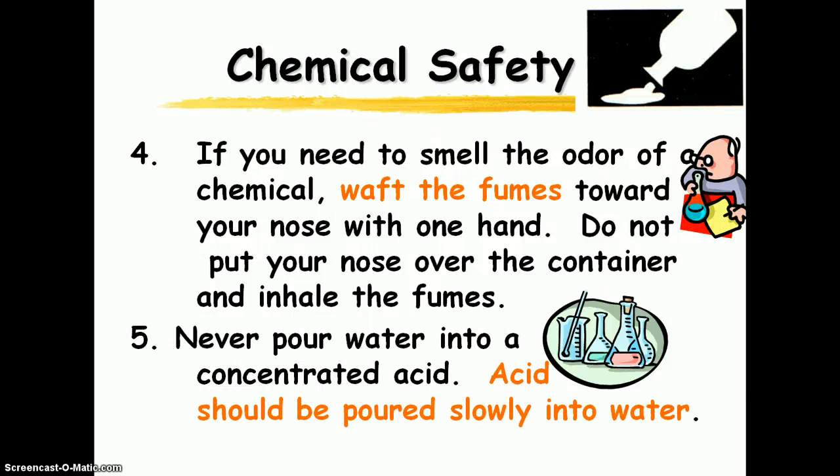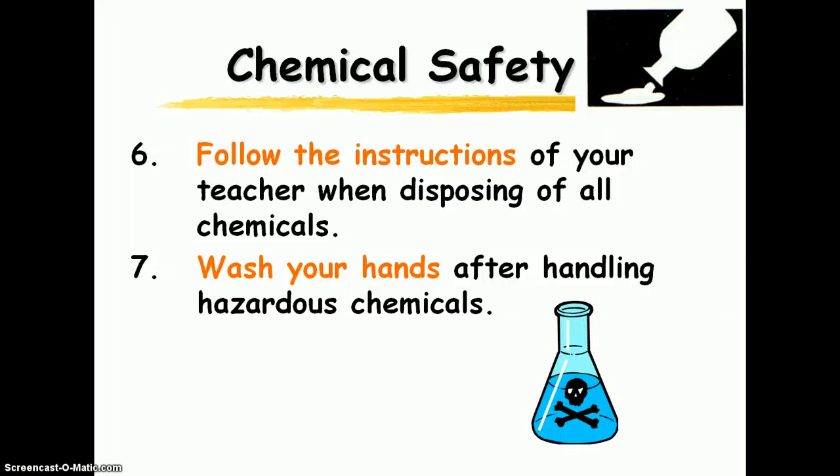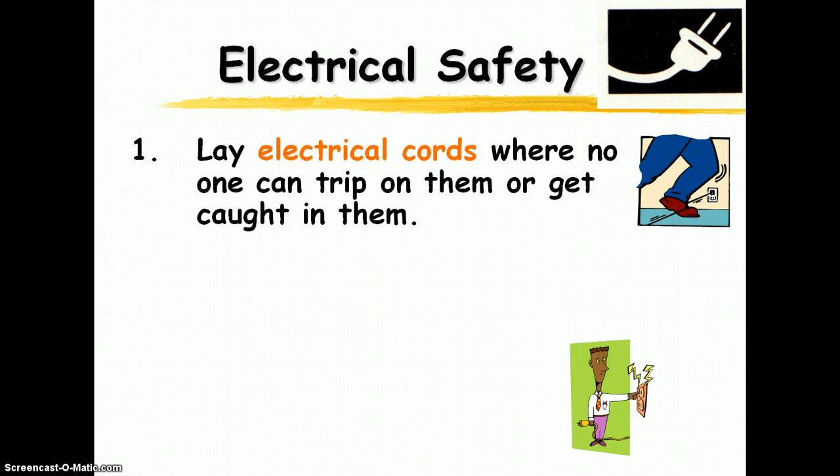Acid should be poured into water, not water into acid — it will react and splatter. Follow all the instructions when disposing of chemicals. If poured down the drain, they could be corrosive to the drain or contaminate the groundwater. If there are chemicals that need special disposal instructions, I will let you know. And again, wash your hands thoroughly with soap and water.